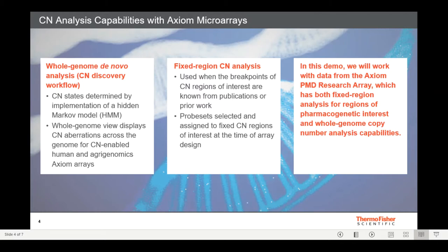The second method of copy number analysis used for some Axiom Microarrays is a Fixed Regions Copy Number Analysis. This method is used when the breakpoints are known for regions of copy number interest, either from publications or from prior research. Please contact your local field application specialist or genotyping sales specialist if you'd like to know more about this capability in your Axiom Array of interest. In this demo, we'll work with data from the Axiom PMD Research Array, which has both Fixed Regions Analysis for regions of pharmacogenetic interest and a whole genome copy number analysis capability.